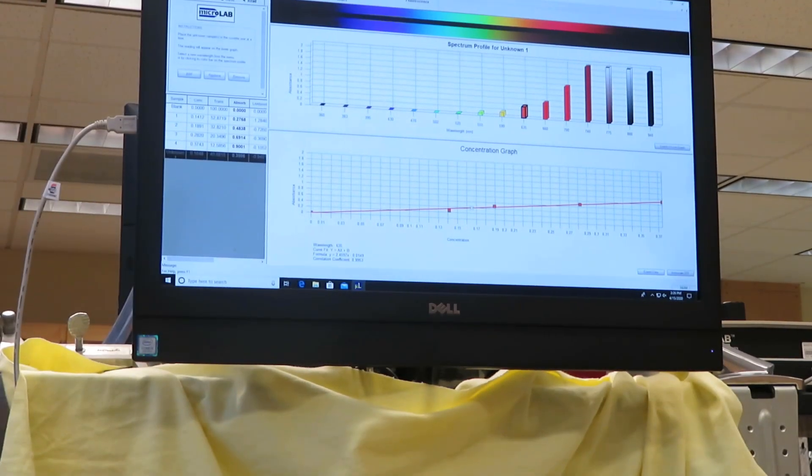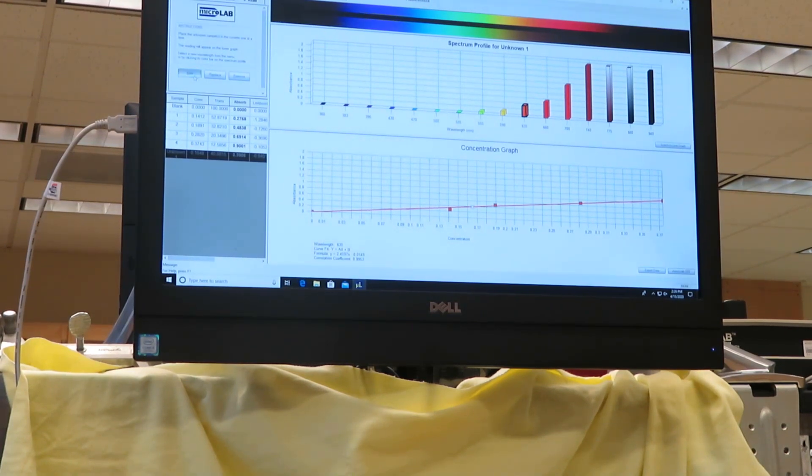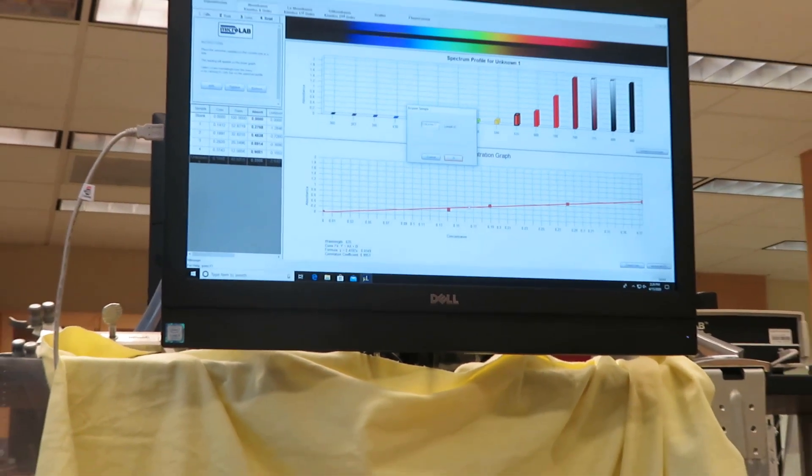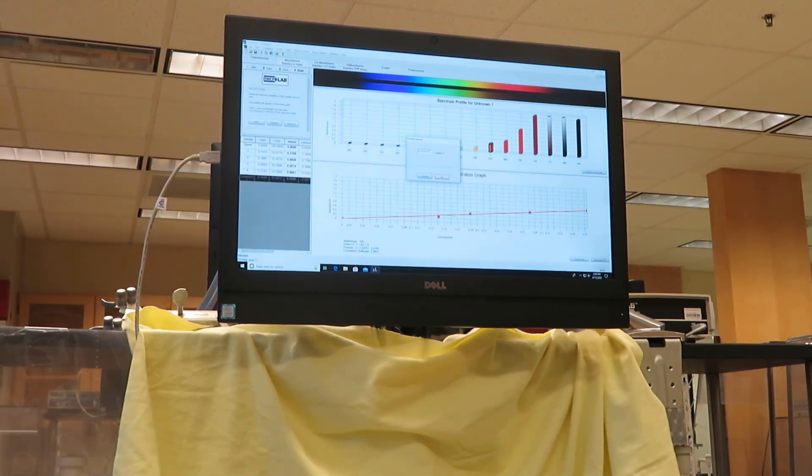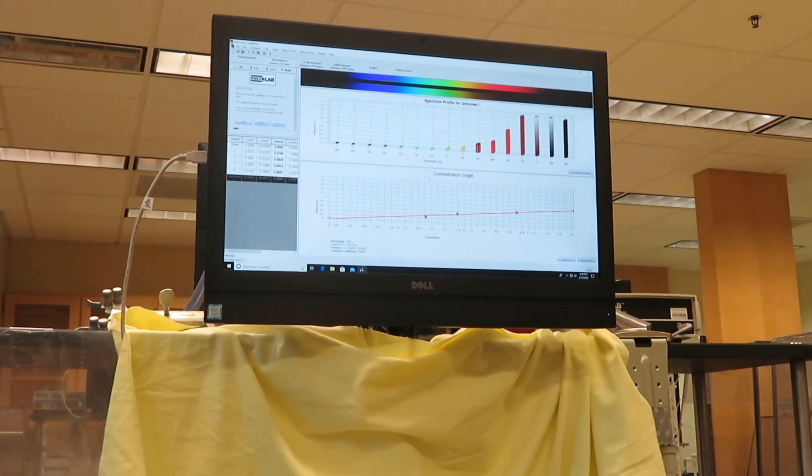I'm still under tab four where I'm reading unknowns. I'm going to add unknown. I'll say unknown B here, so I know it's the one that I made for Part B. And we'll click on OK.